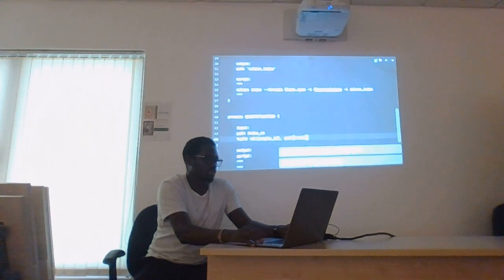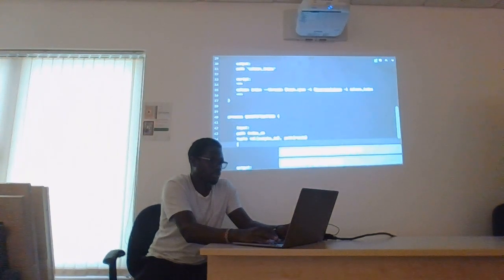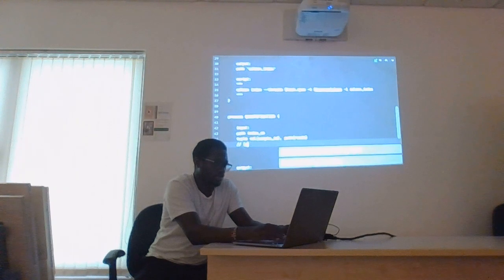So what this is represented as is simply, let me try and put it here. Maybe we have GAT as a sample name, and then a list having the path to those files.